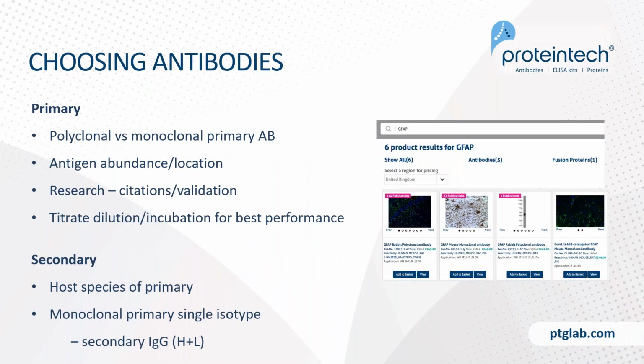It's really important that we carefully choose our antibodies when performing immunofluorescence. In general, polyclonal antibodies are most traditionally used for immunofluorescence. Sorry if people know this already, but a polyclonal antibody is where the antibodies have been raised against the whole protein or peptide, and therefore there are many antibodies to many different epitopes on this protein, and therefore they have higher affinity.